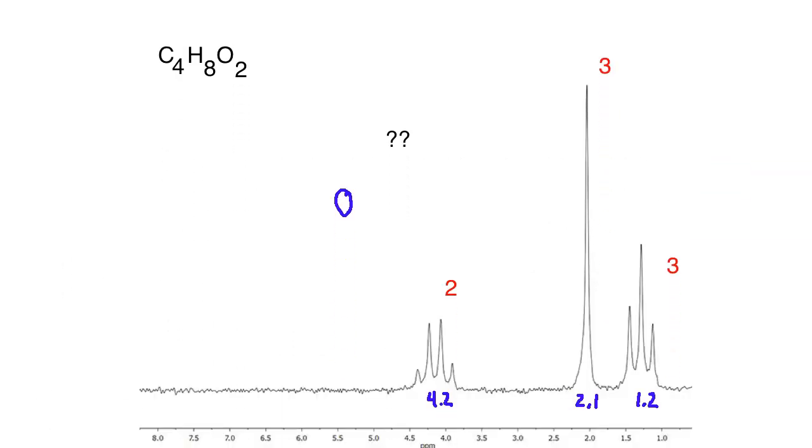And so if I were to take a look at this, I probably have some sort of a CH2 group, based on the integration, next to an oxygen, right? And then what I can also determine from that point is that I likely have, because this is a quartet, a CH3 as a neighbor because of the N+1 rule. So I would have a CH3 as a neighbor, right? Now that would be terminal because the CH3 cannot have anything else bound to it. So that's one end of the molecule right there. Now what I also want to confirm is if I did this correctly, then I should find the CH3 signal as a triplet and it should integrate to 3. And sure enough, down at 1.2, I see a triplet that integrates to 3. So this is most likely going to be one section of my compound.